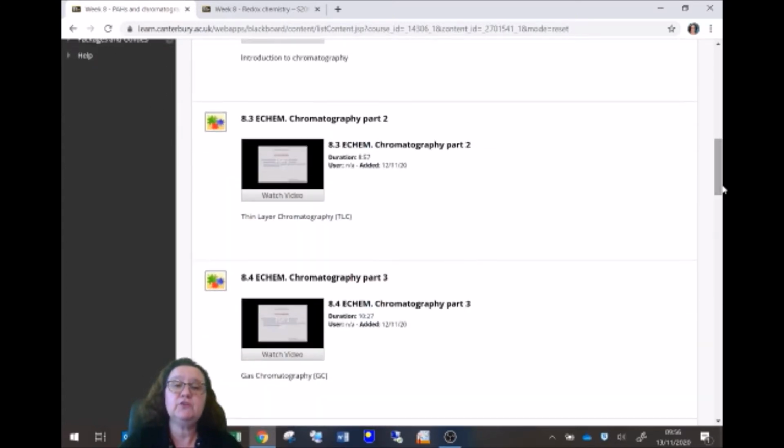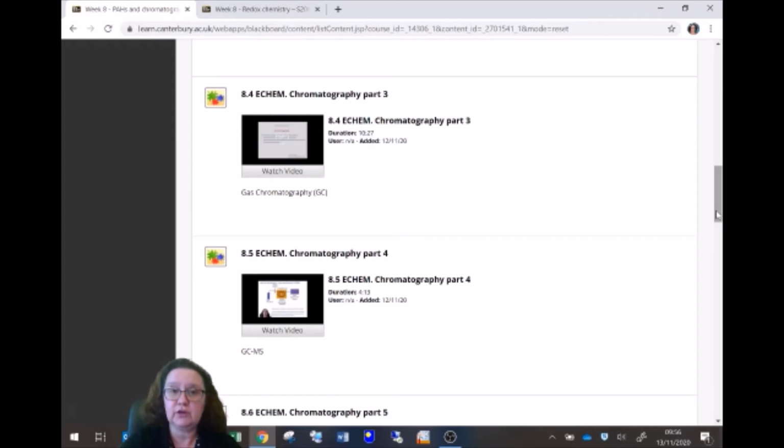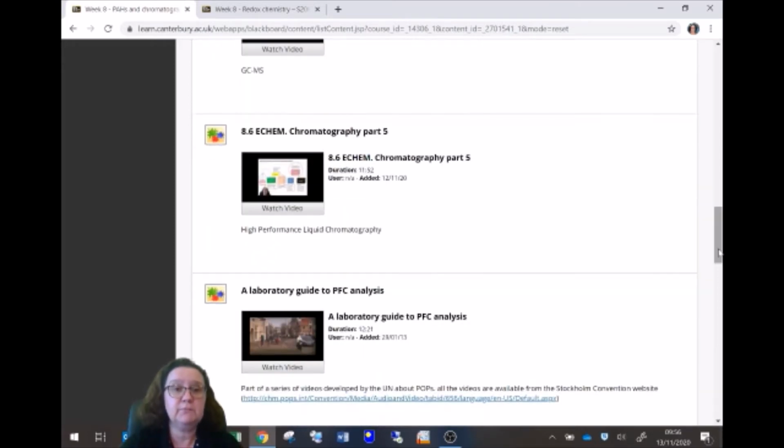You've got another video dedicated exclusively to thin layer chromatography, TLC. Another video on gas chromatography, GC, and one short video dedicated to a specific type of gas chromatography, which is GCMS, gas chromatography coupled with mass spectrometry. And the last video from me will be one dedicated to HPLC, high performance liquid chromatography.